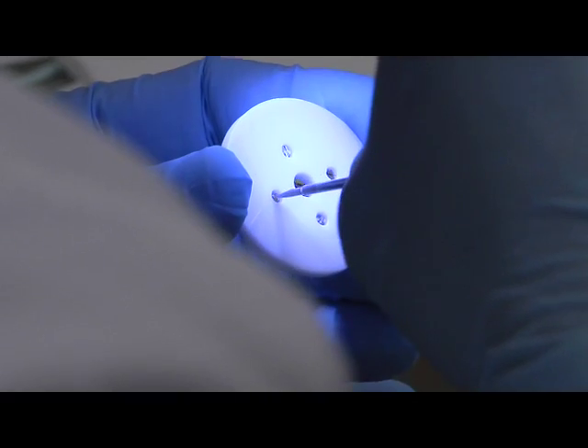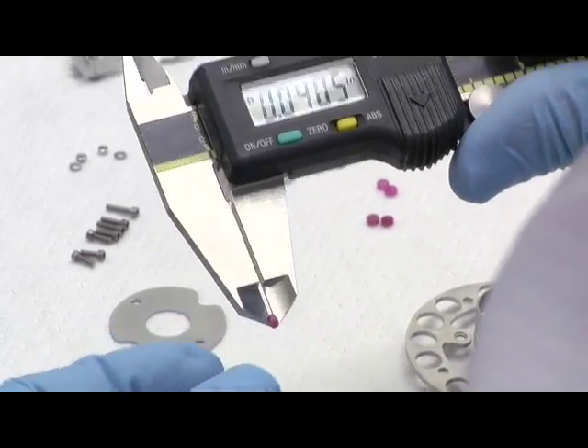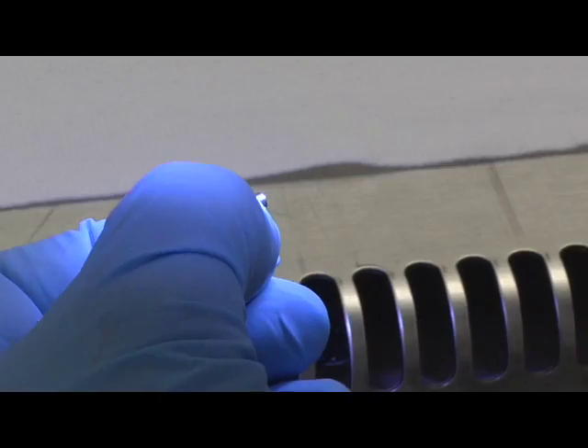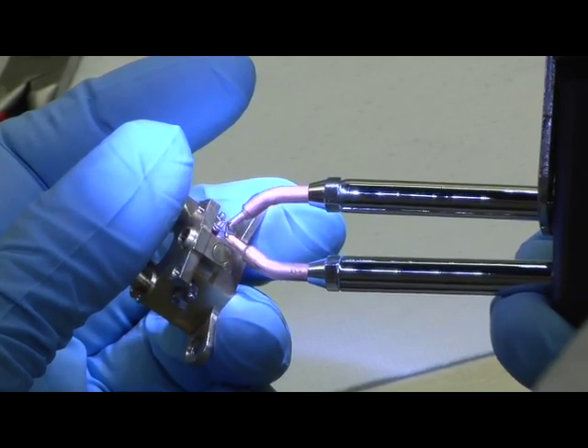The scale of the work is definitely one of the biggest challenges, and I think that's one of the reasons why it's not easy to find somebody to do this kind of work. The filaments that go in the electron guns are not quite twice the size of a human hair, and being that small, you can't handle them with your fingers — you have to use tweezers or pliers.